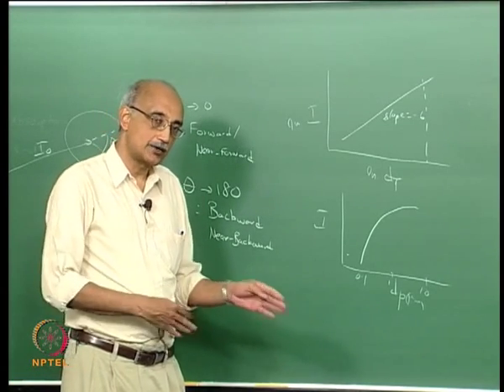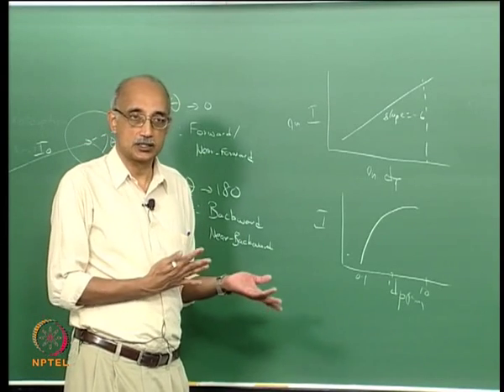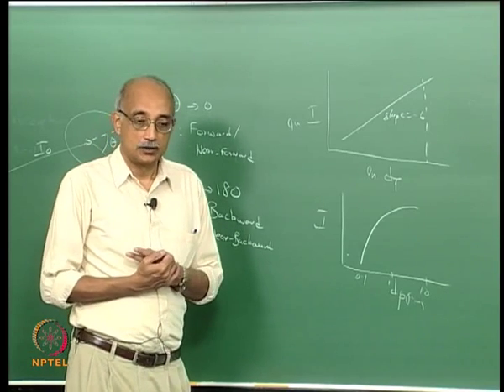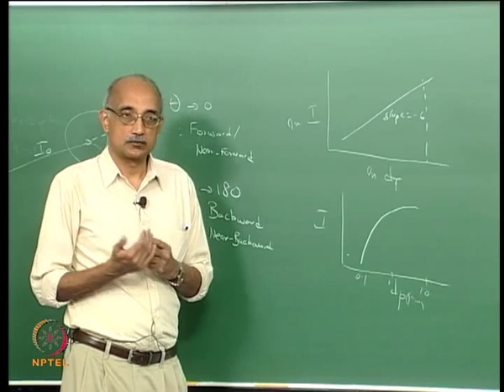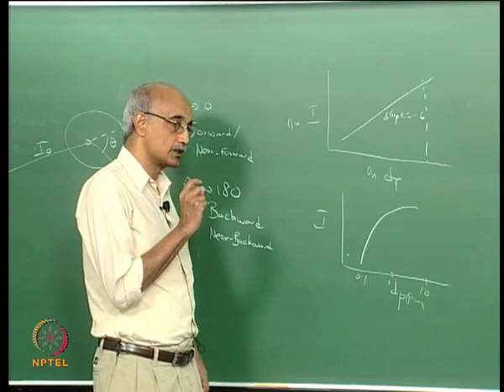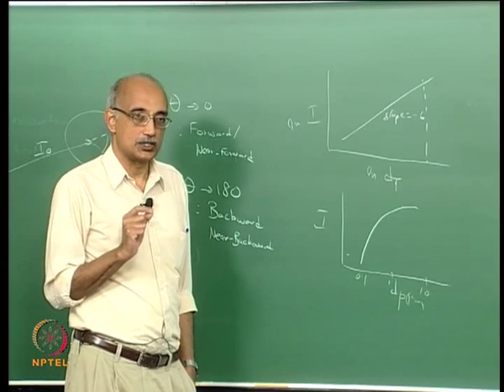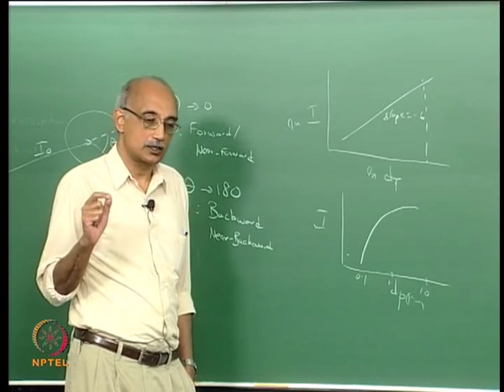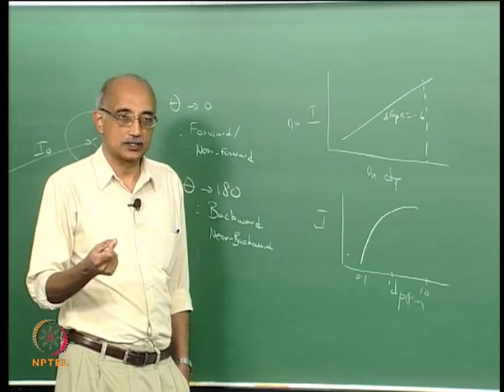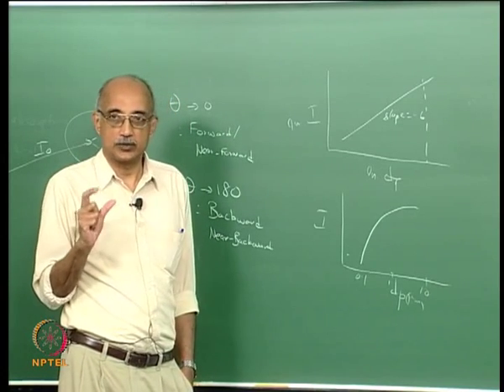Do you give up on light scattering and move to something else? The problem is there is no other technique that works even as well as light scattering. I mean, what is your option? You can, if you want, use something like a scanning electron microscope, a transmission electron microscope or an atomic force microscope, but to do particle size analysis using such tools is not an optimum procedure, because these instruments are really intended as qualitative characterization tools. You want to use them when you are trying to characterize the surface or the morphology of a particle, not simply to quantitatively determine the size.